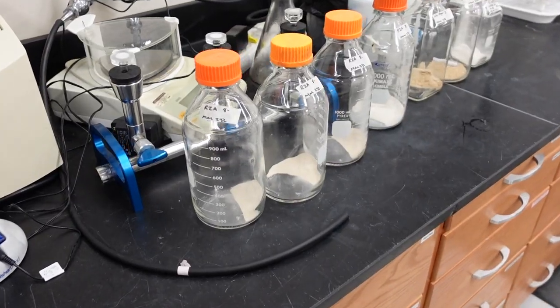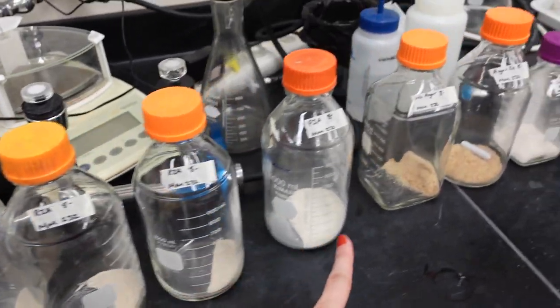And then in the meantime, I got all those tubes labeled. Oh, I guess I filmed that. That was on my phone, so I could be a little incognito about it. And then I got a bunch of agar weighed out for Monday or Tuesday, probably Monday, so I can just add water and then they're all good to go.